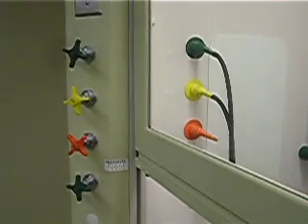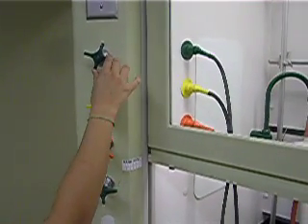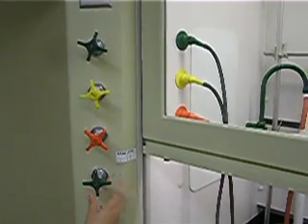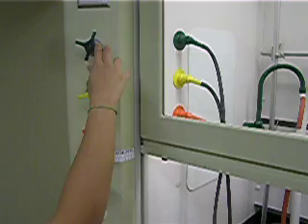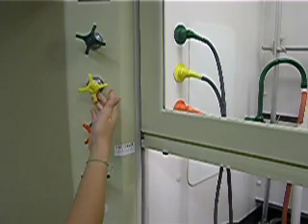Outside your student work area you will have four valves. The first one is for water in to your hood. The last one is water for your aspirator — make sure when using water for the aspirator to turn it all the way on, whereas for water in, you just want about a quarter turn. The orange one is for lab air, and the yellow one — the vacuum — you will never use.